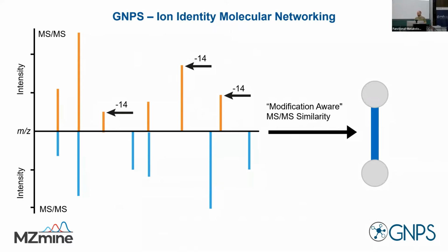So the promise is that we look at two different things. And of course, everyone here hopes it's one known thing and one analog of a known thing, right? Which is the new compound we want to discover. So we already look at something that has a precursor MZ difference. If we look at the precursor MZ difference here, it's shifted by 14.